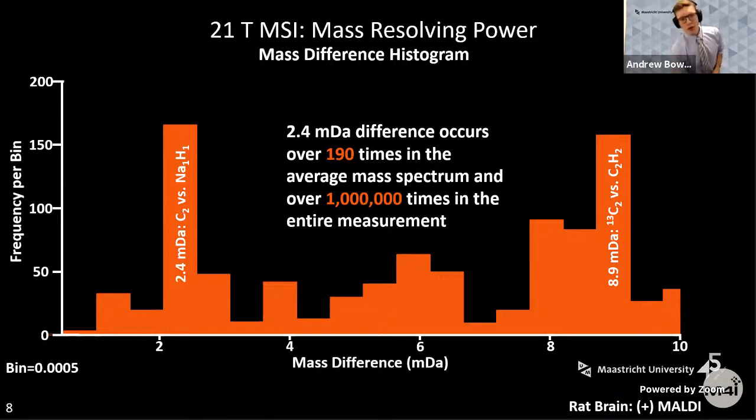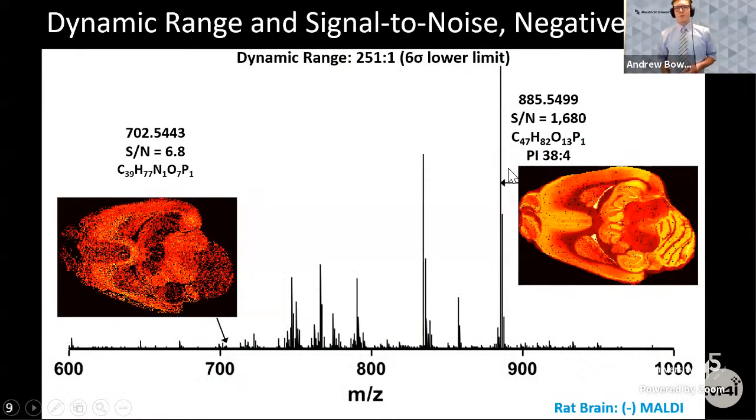For reference, those are this separation down here, and then over here on the right side, this is a more normal split to find in high resolution mass spectra. This is 2 carbon-13s versus 2 less double bonds. We also did these experiments in negative mode.